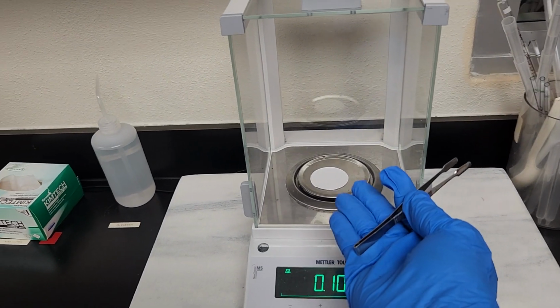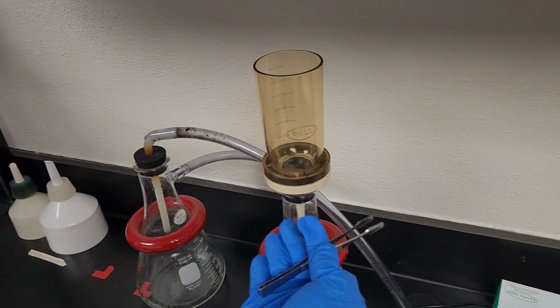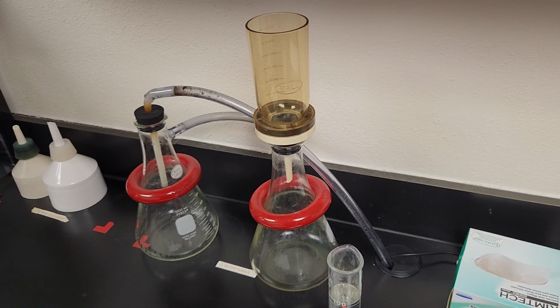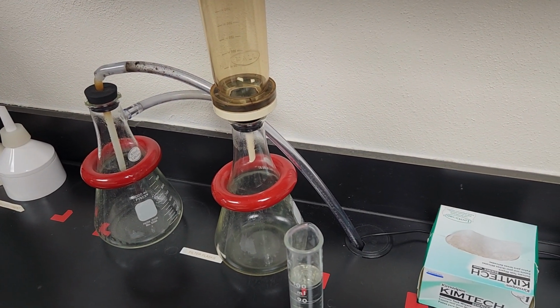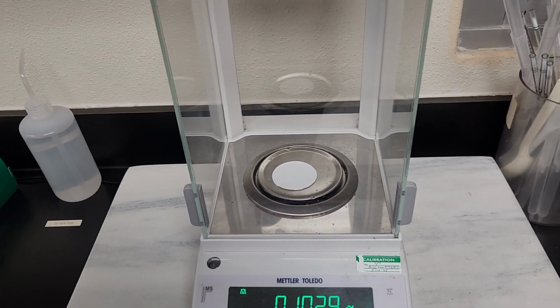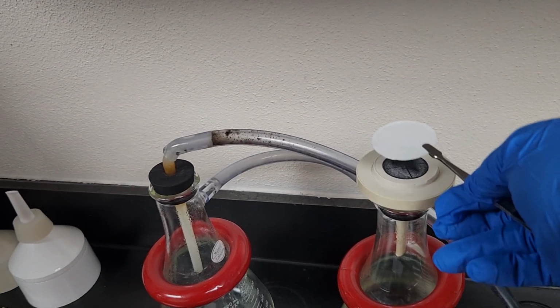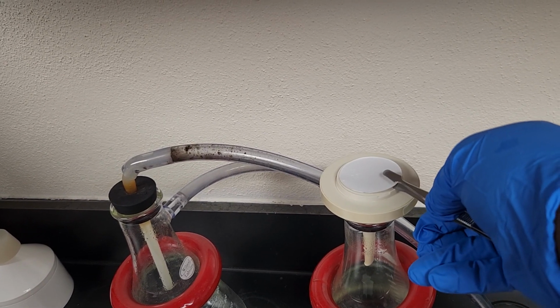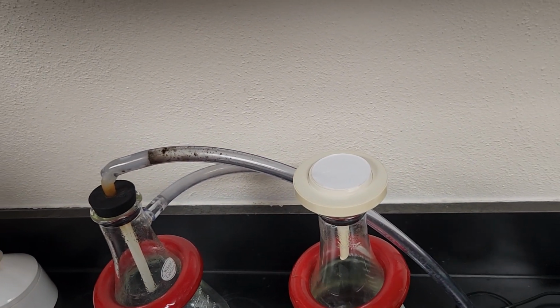We'll bring out the second filter and place it in our filtration system and turn on our compressor to drain out the unwanted liquid and only leave the solid. So that is what we want. So go ahead and do that now. So placing these filters and installing this.